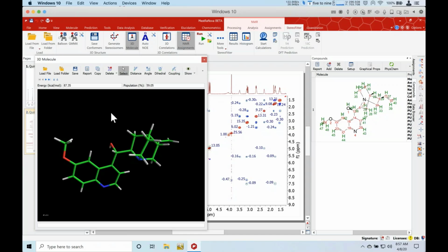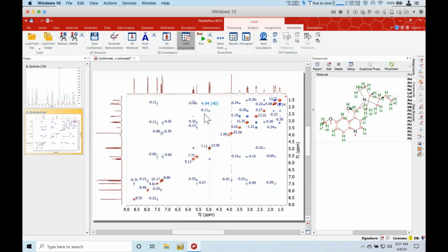So what we've done is we prepared the set of conformations that we believe to be credible, which we believe to be representative of real life and solution in the tube. So that's part 1 of what we need to do. Part 2 is the NMR constraints.